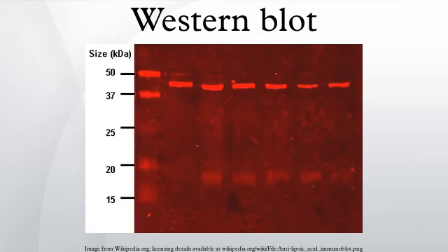One step: historically, the probing process was performed in 2 steps because of the relative ease of producing primary and secondary antibodies in separate processes. This gives researchers and corporations huge advantages in terms of flexibility, and adds an amplification step to the detection process.